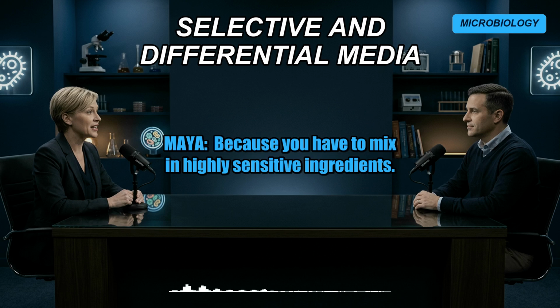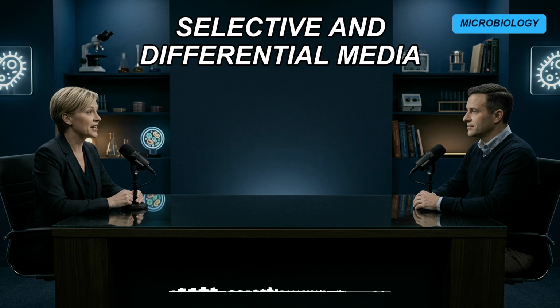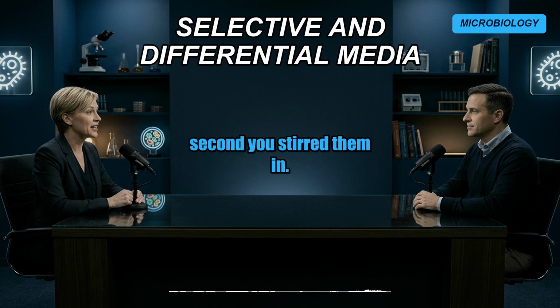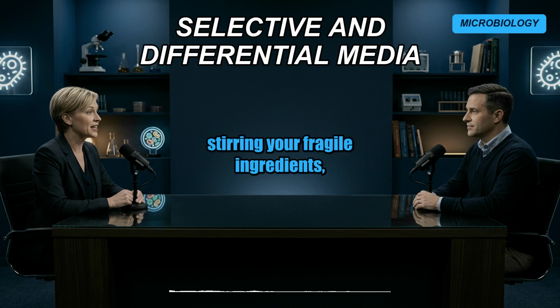Because you have to mix in highly sensitive ingredients, things like specialized sugars, antibiotics, or even whole red blood cells. If the agar had to be boiling hot to stay liquid, you would just cook and destroy those delicate additives the second you stirred them in. Oh, right. Yeah, with agar, you can let it cool to like a nice warm bath temperature, stir in your fragile ingredients, pour it, and then let it set.